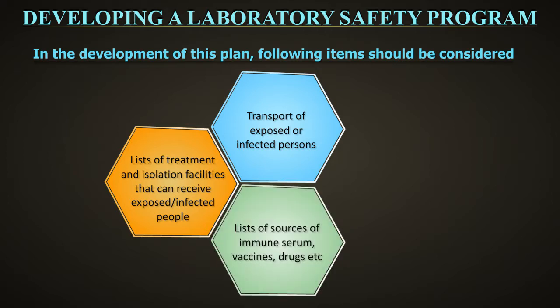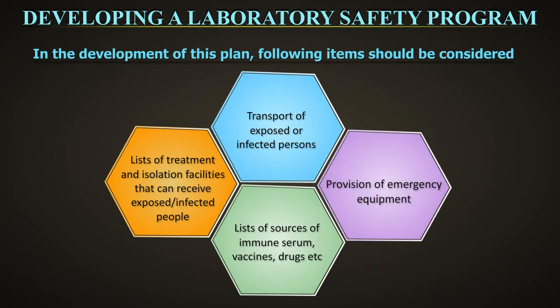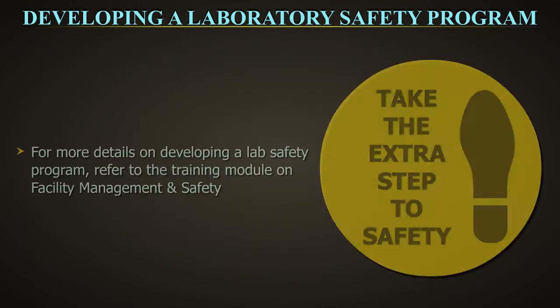The plan should also include lists of sources of immune serum, vaccines, drugs, etc., as well as provision of emergency equipment such as PPE, disinfectants, chemical and biological spill kits, and decontamination equipment and supplies.